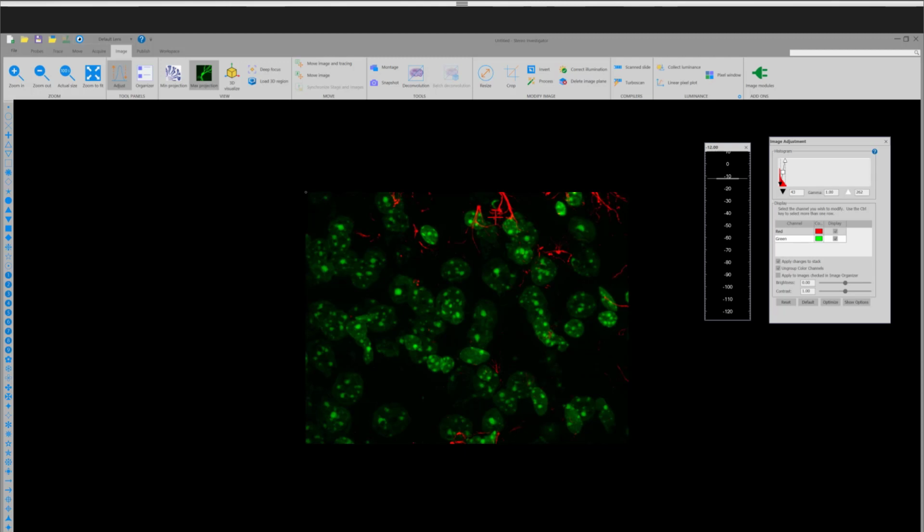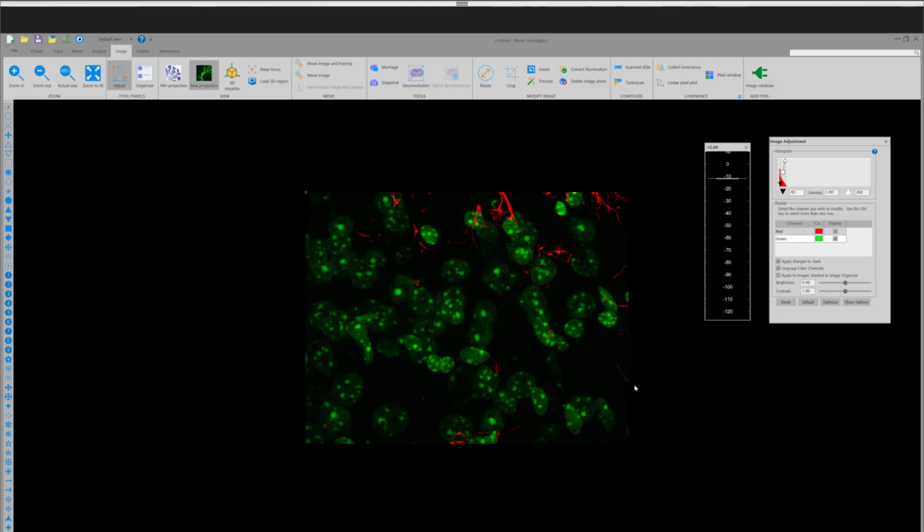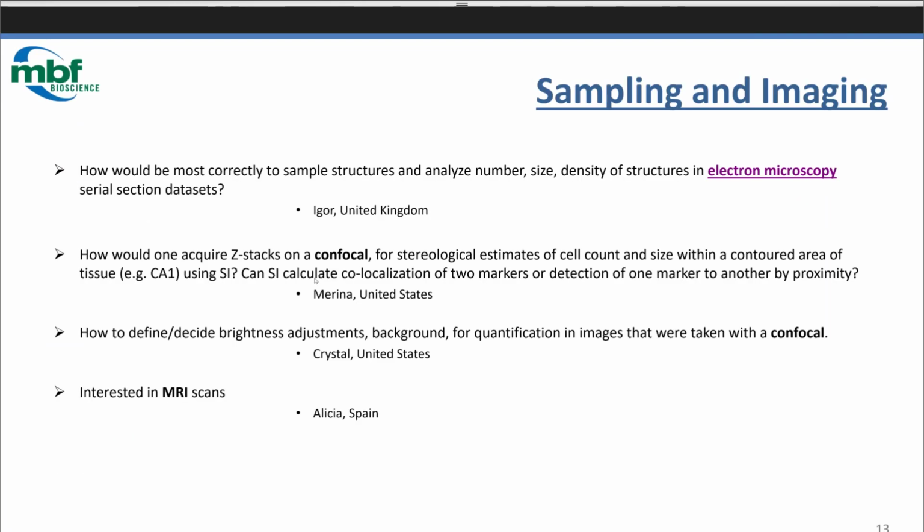So we can open MRI stacks and confocal stacks. With the confocal stacks, it can be multi-channel. We can look at different channels individually and adjust the channels individually. So let's get back to our PowerPoint presentation. Okay, so let's go back to Marina's question.